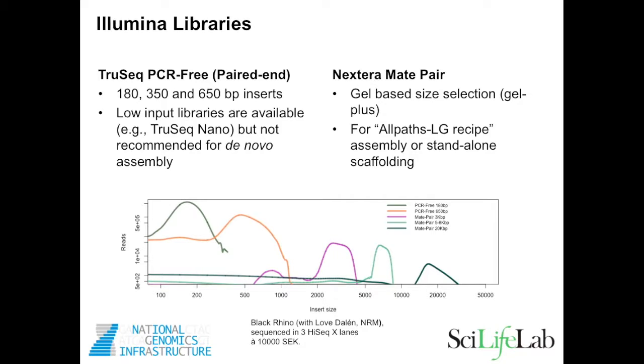So the first two paired end libraries are used for contig assembly. That is a contiguous sequence without any gaps, and then using the mate pair libraries in succession to bridge gaps in the genomes. That is, for instance, repeats that cannot be spanned by these shorter libraries.